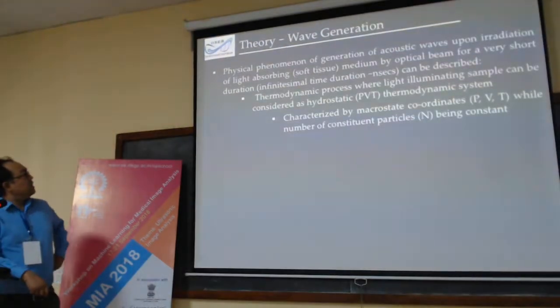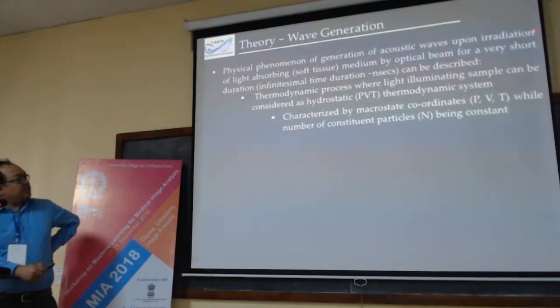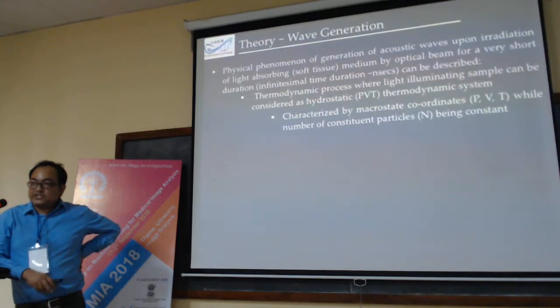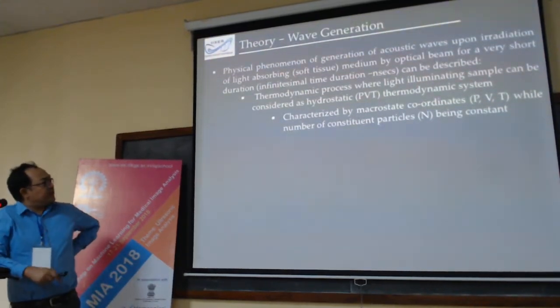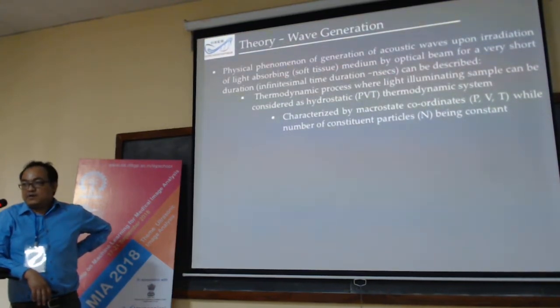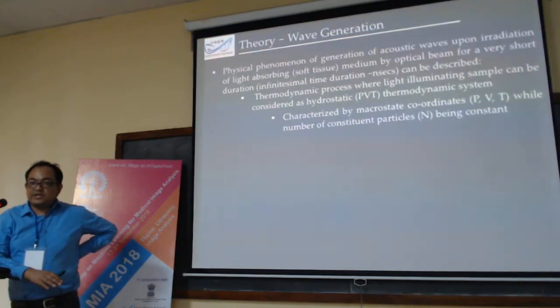So, the entire physical phenomenon of the generation of the acoustic wave upon irradiation of the light absorbing material for a short duration of light can be described as a thermodynamic system characterized by temperature, pressure, and volume, while considering that the number of constituent particles is constant, meaning no chemical activities are happening with the illumination during this process.